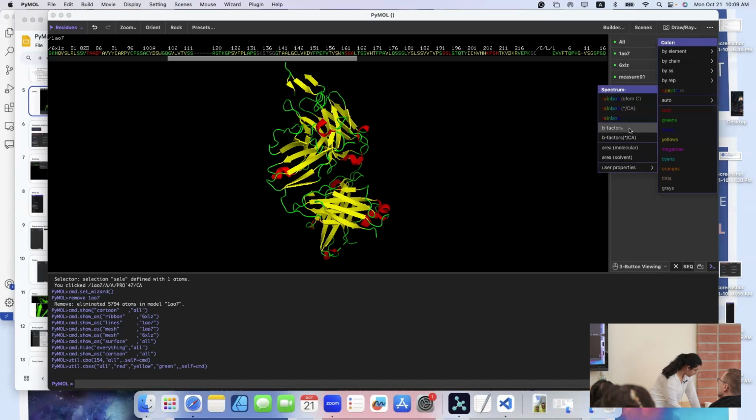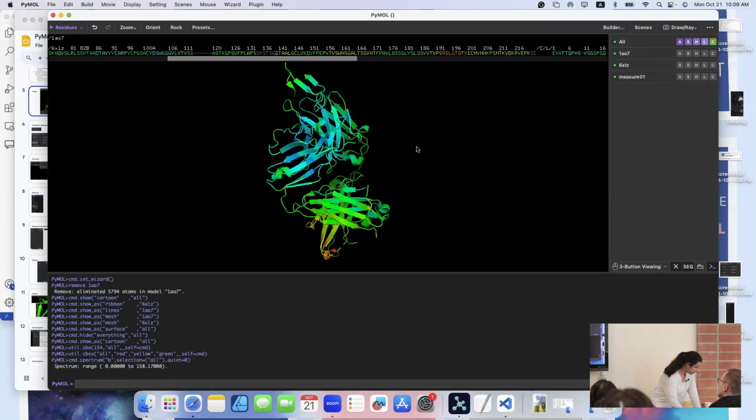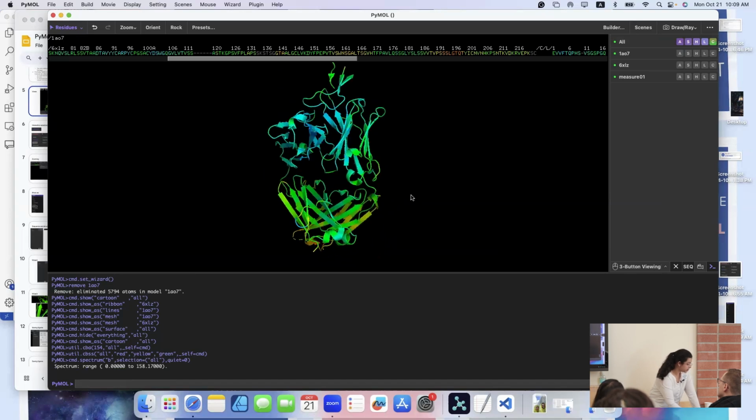Okay, so one of the really useful things is B factor. B factor is basically going to be a column at the very, very end of your PDB. And so it can store temperature information. And so temperature information will basically tell you how flexible a particular part of that structure is. And then with AlphaFold outputs and a lot of current outputs, what B factor will actually hold is the level of confidence that model has for how well they've predicted that particular structure. And so if you just put it into PyMol, put the color, you get a very quick idea of what it's really, really confident about and what the problem areas are.